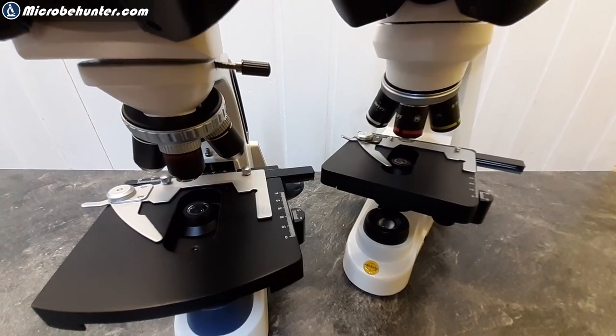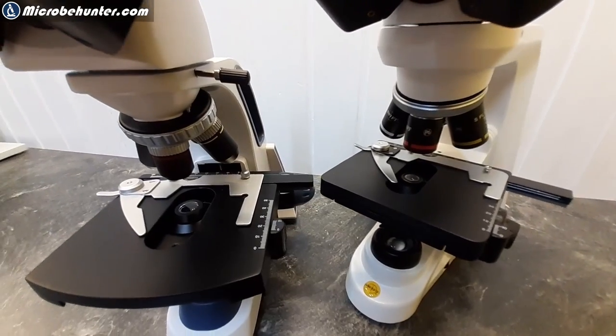So now let's have a closer look at those microscopes. I made already separate review videos for each one, but in this video I really want to do a side-by-side comparison.